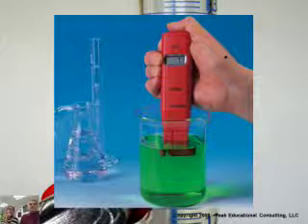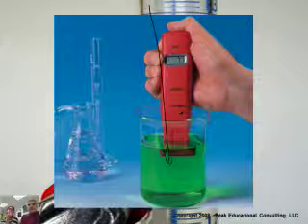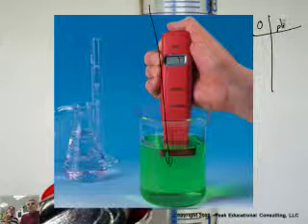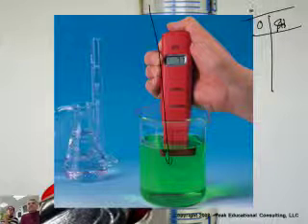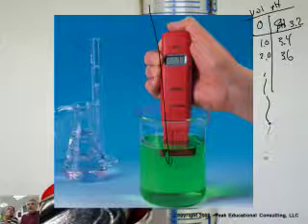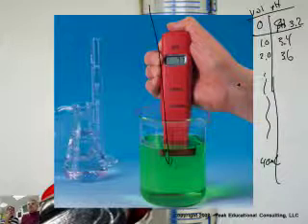So here's a pH meter. A guy using a pH meter, and then he would have a burette like we showed in the demonstration, and he'd be adding to it. It's really kind of a tedious process. It is. You'd have 0 milliliters, you'd have a table, and then you'd record the pH. So this would be volume, and this pH. So at 0, maybe the pH is 3.2. At 1.0 milliliter, it's 3.4. At 2.0, it's 3.6, and you would go down till you get to 40 milliliters, and maybe it's whatever. It's very tedious.